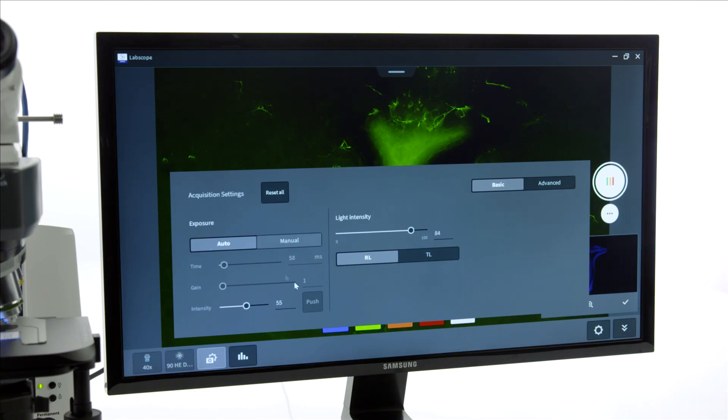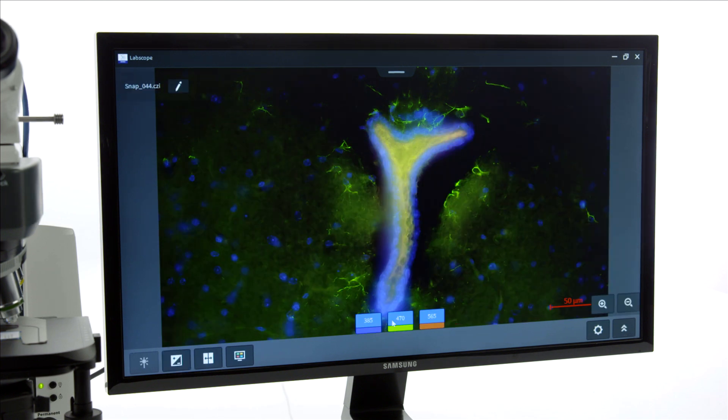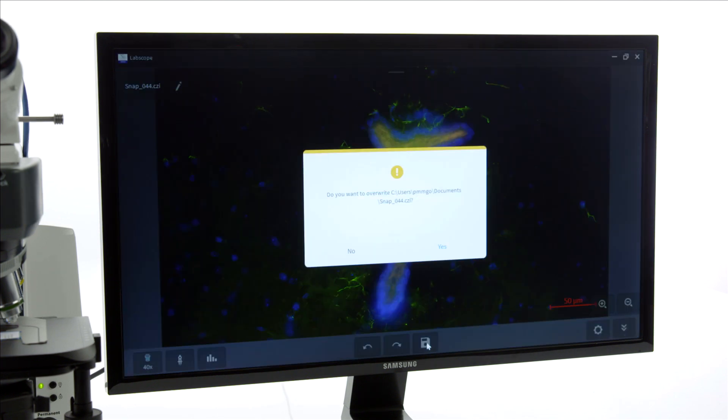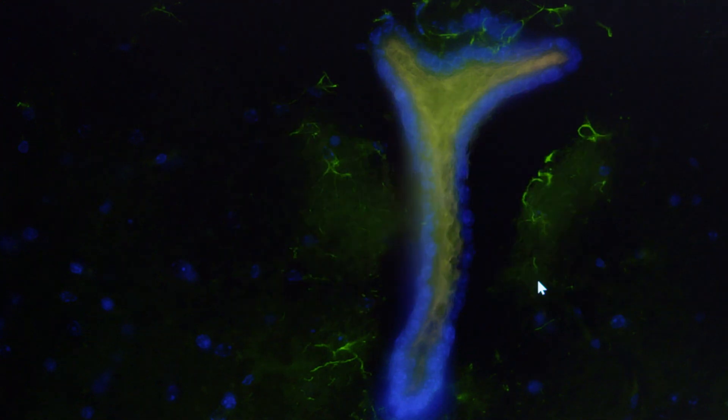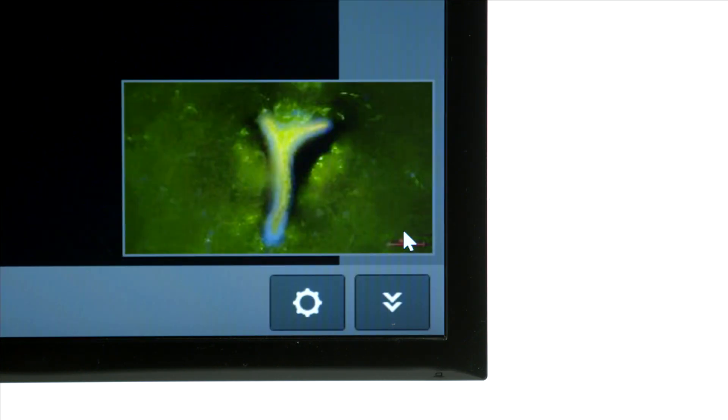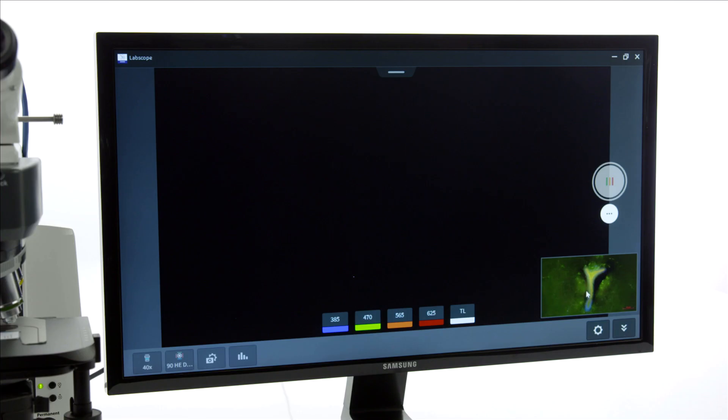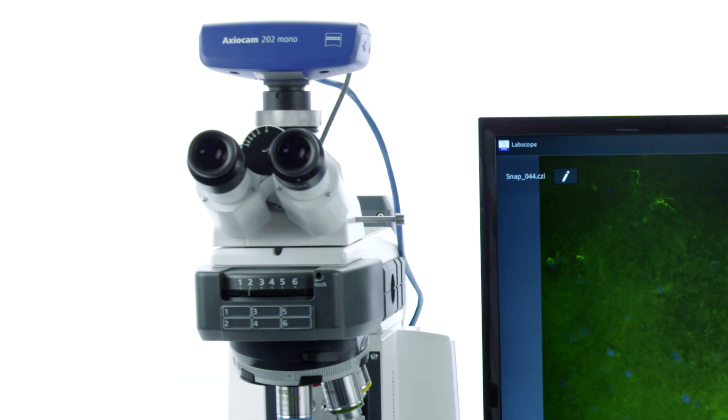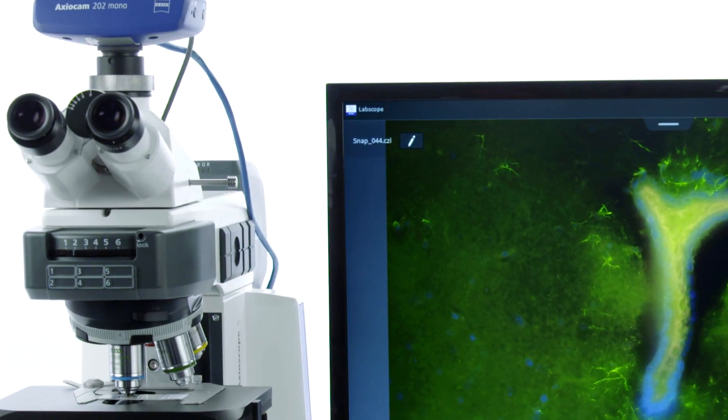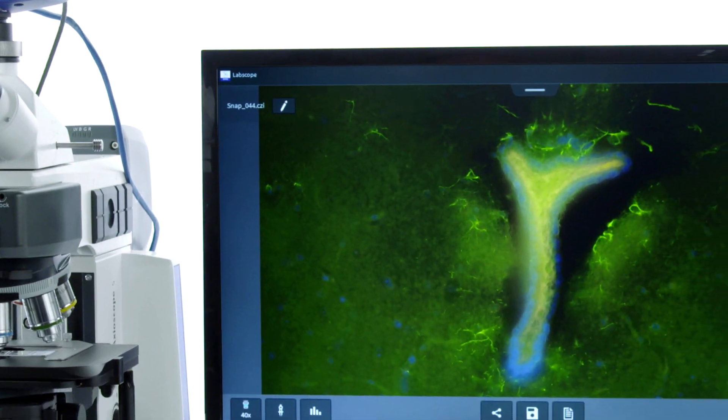Illumination and exposure settings are memorized for each channel. You can revisit a channel and easily overwrite it. Once you are done, accept the result. The full metadata including scaling information is stored with the image.